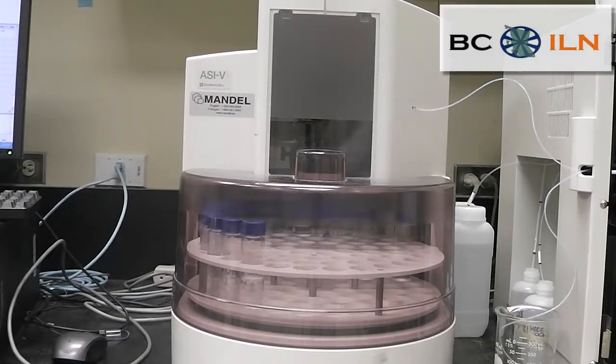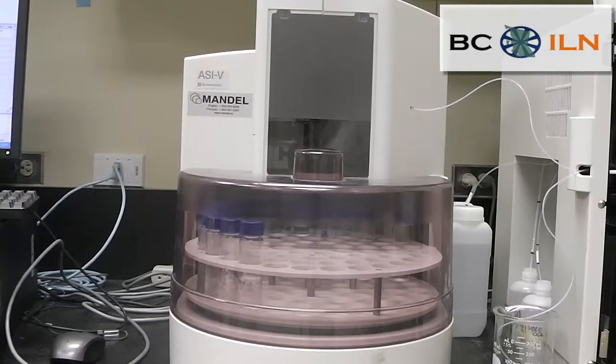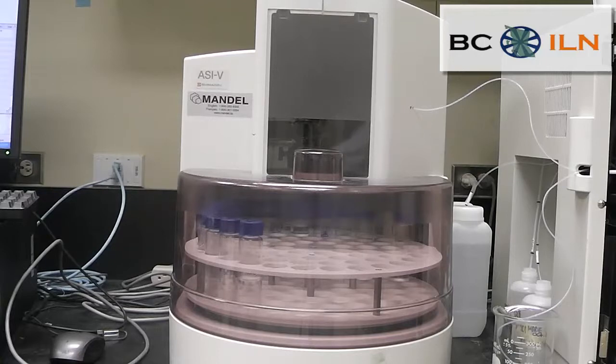The samples are pre-treated and put into vials. Vials are placed in the auto-sampler, which is what I'm showing you here. A needle pierces the septa, a round rubber-like piece that is part of the vial lid, on the top of the vial and draws up a pre-selected amount.